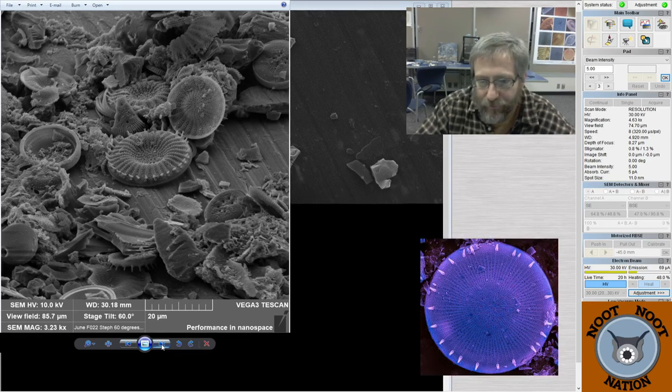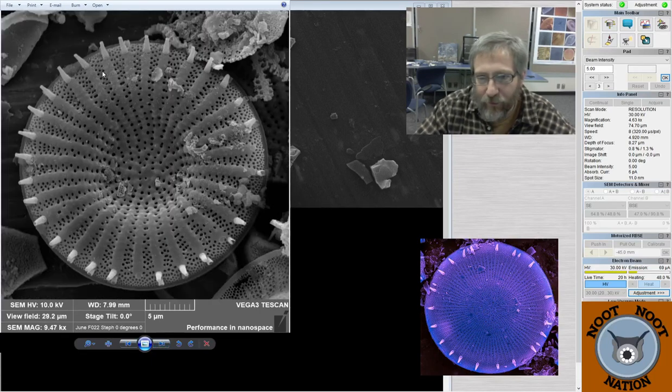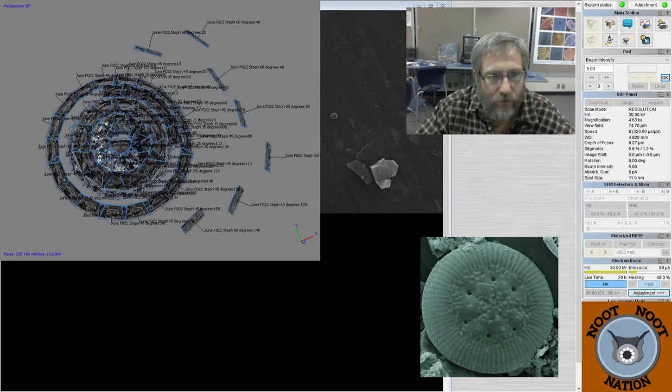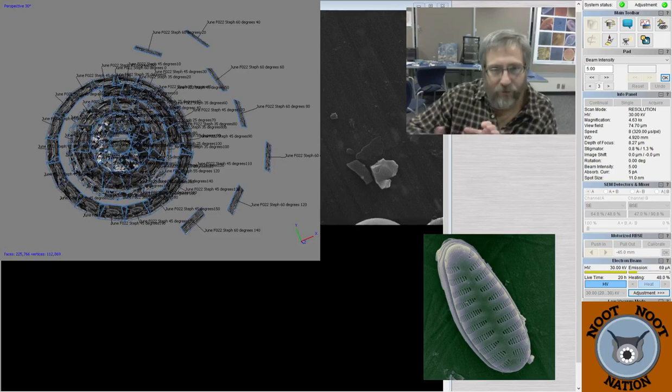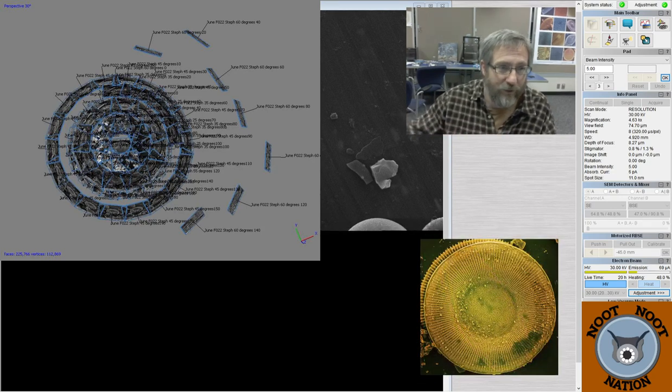And that's the whole thing. So we took maybe 70 photos of this diatom, and then let's see, what we did was we put it into this program, and you can see every one of the photos that I just showed you, their locations were identified by a computer. It could use the context of the image to try to figure out where that picture was collected from, and it did this. We didn't go in and tell it where to put them.